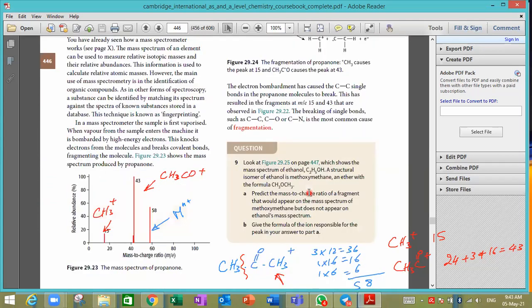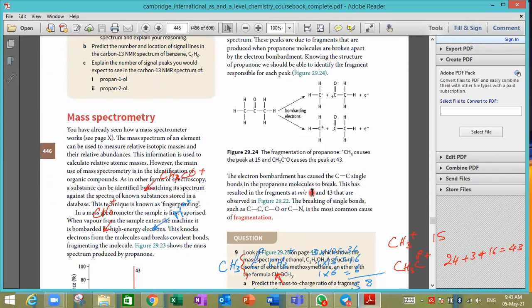What if we fragment a big molecule and we had, let's say, 3 products or 3 parts? Which one would be the free radical? No, every time it's going to be fragmented into only 2 parts. One of them is going to be a positive ion and the other will be a free radical. It cannot be fragmented into 3 different parts, only 2 parts.